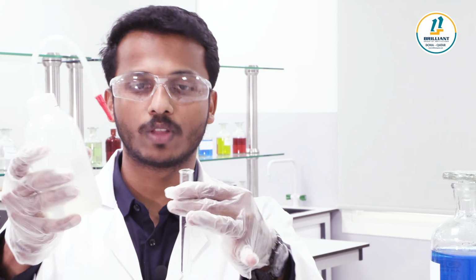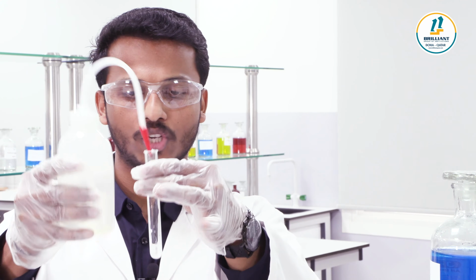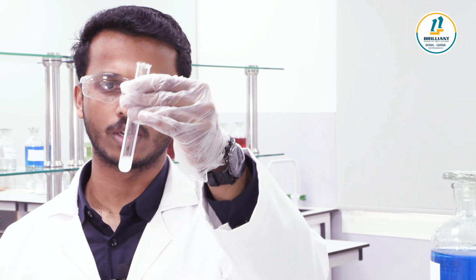Here I am going to do the experiment with a salt solution. Add some amount of water, shake it well and dissolve it. Maximum shake it and dissolve it. So this is a salt solution.